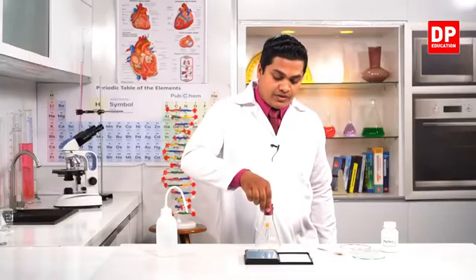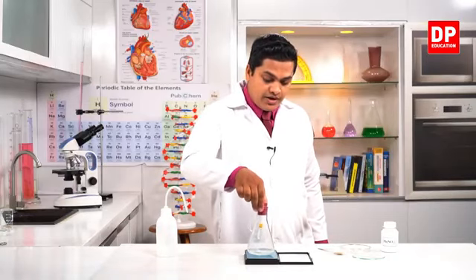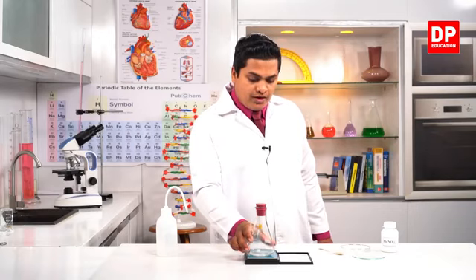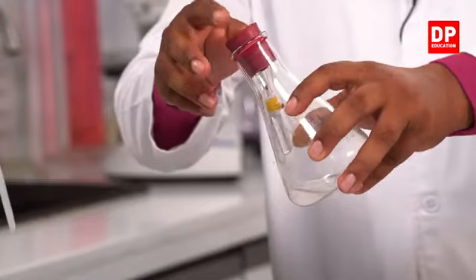Now I'm going to place it on the balance to measure the entire mass of it. So my final value is 175.28. That's my final value, 175.28.